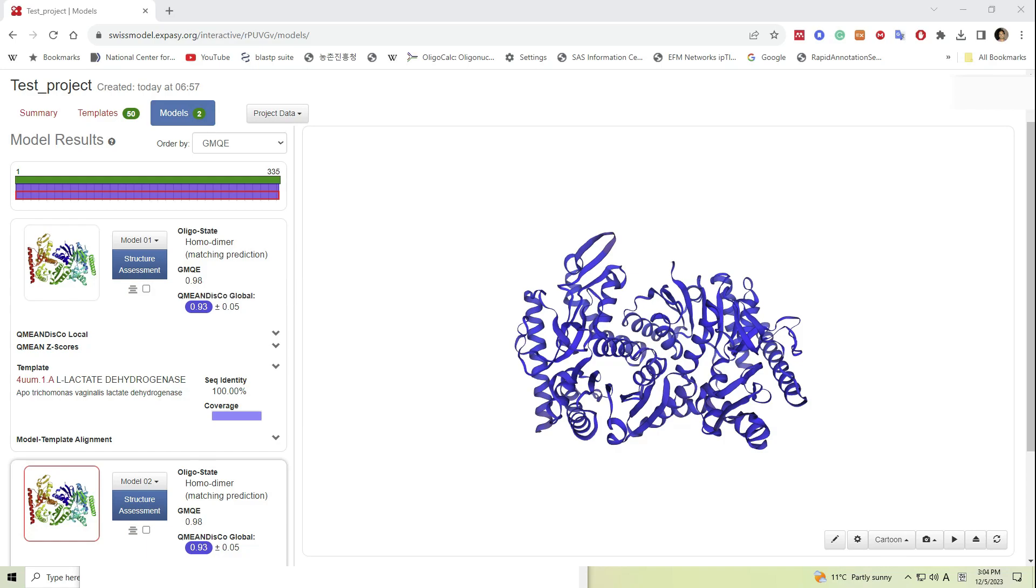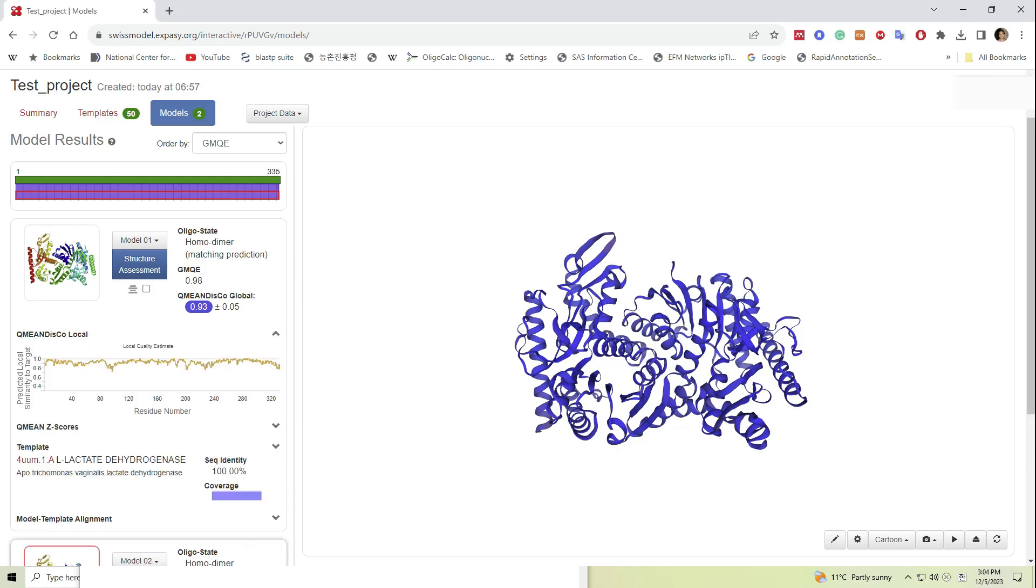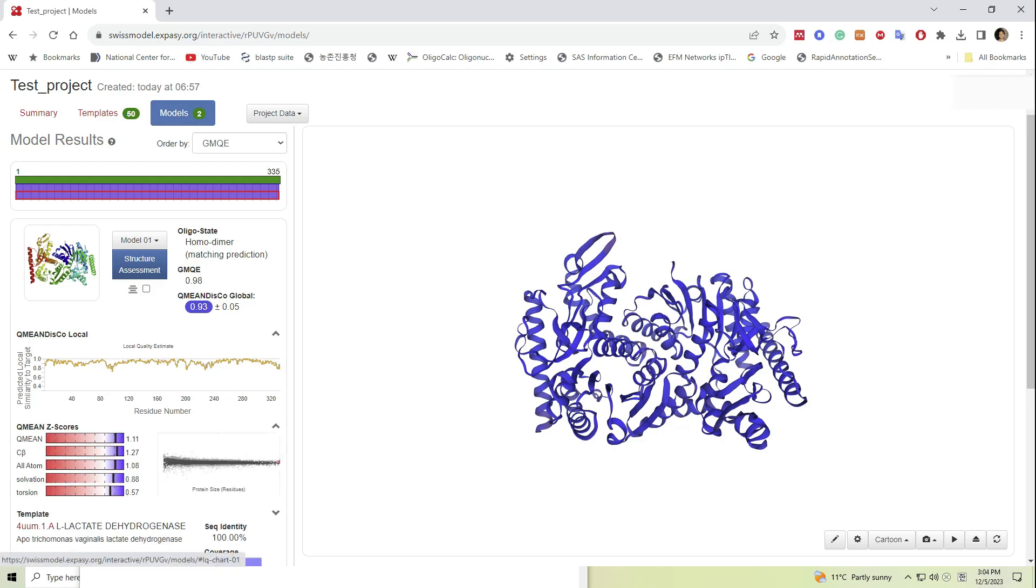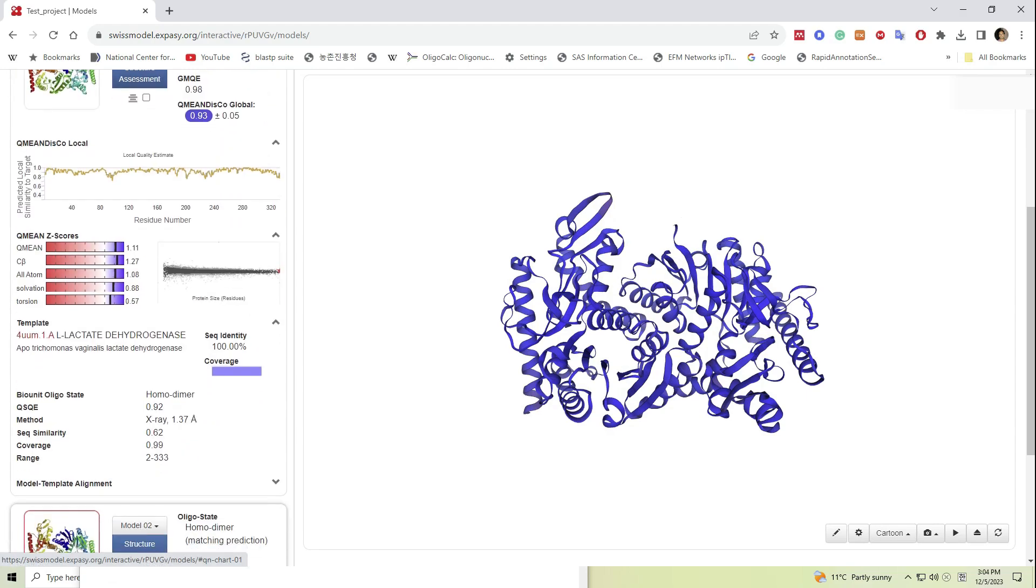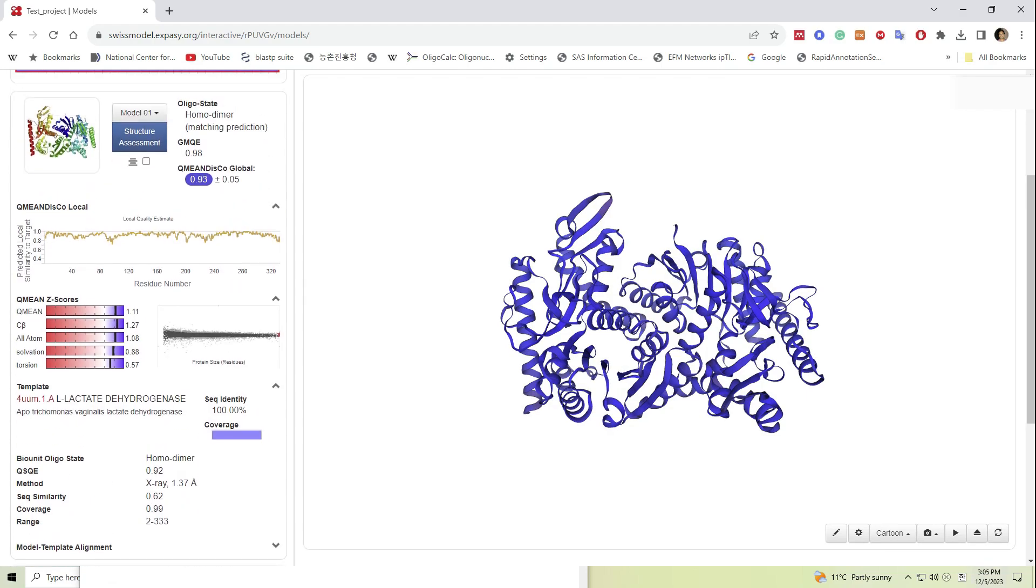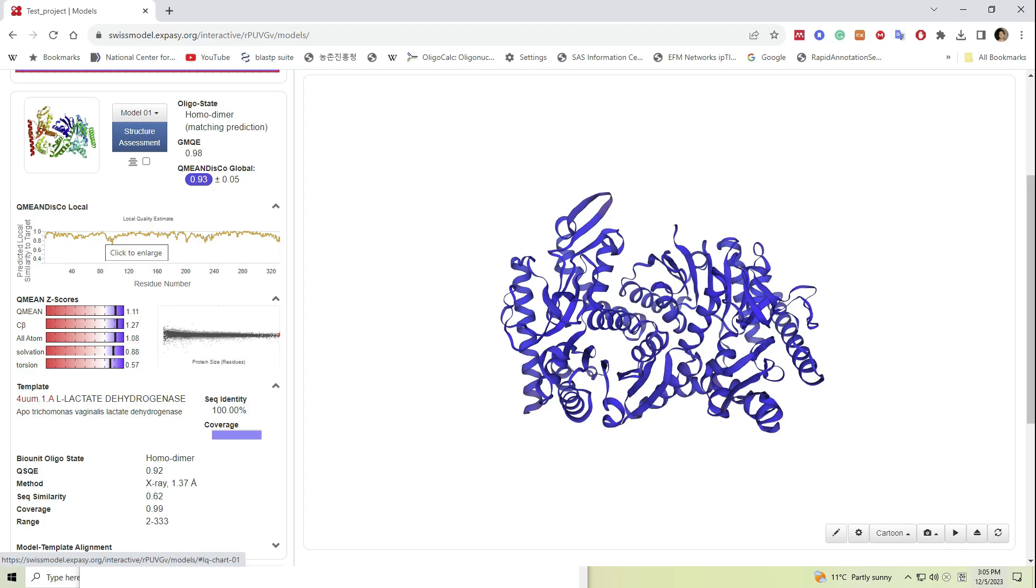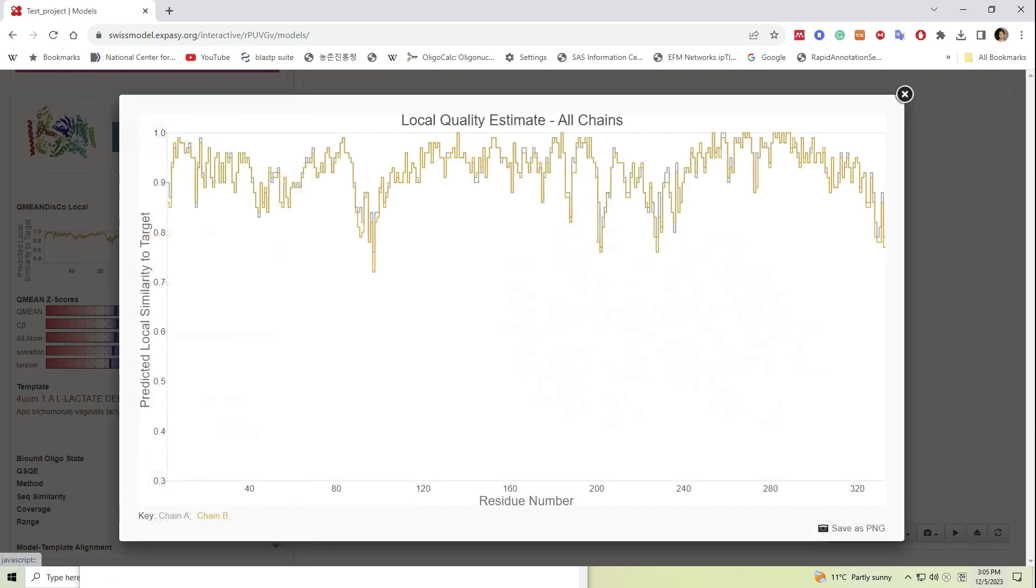To assess the quality of the predicted model, we can make use of the scores given with each structure. We can check oligostate, GMQE that stands for global model quality estimate, qualitative mean energy analysis values, etc. These scores above 0.7 means that the model is fairly built for subsequent analysis.